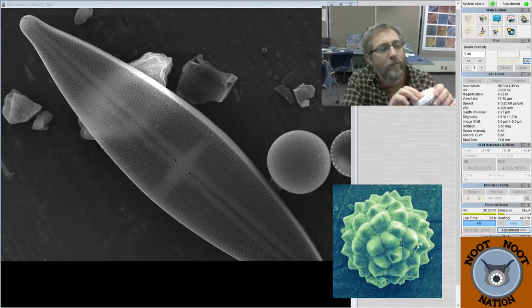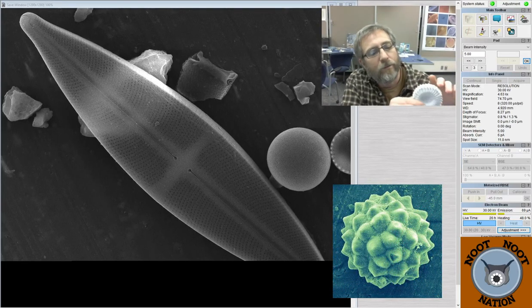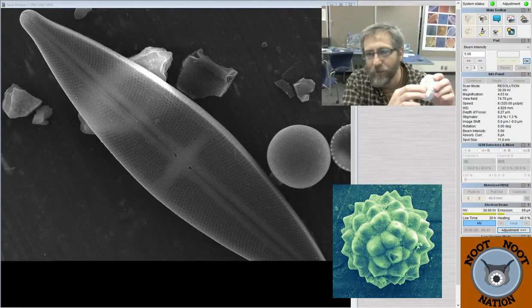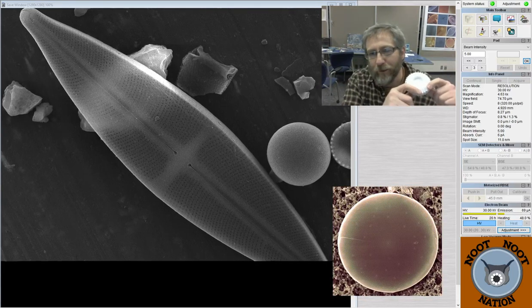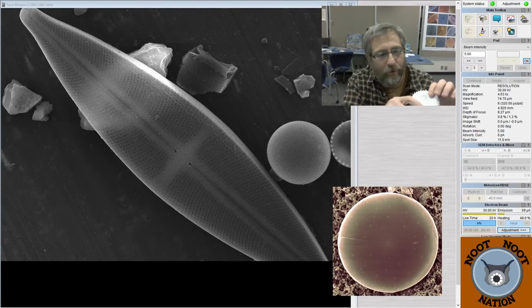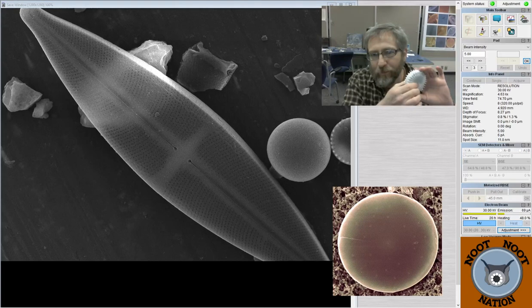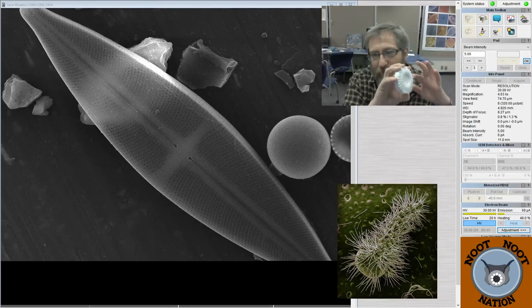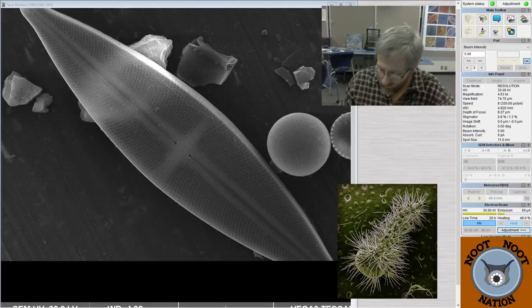The person that I worked with, Dr. Alex Badillo, also cleaned some of the junk off of the material, and then basically we had an STL file when we were done, and we can actually provide the STL for the model, if you wanted to print this diatom on your own 3D printer.